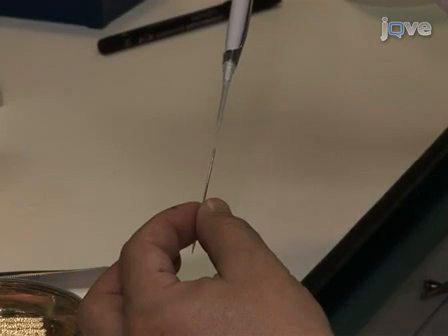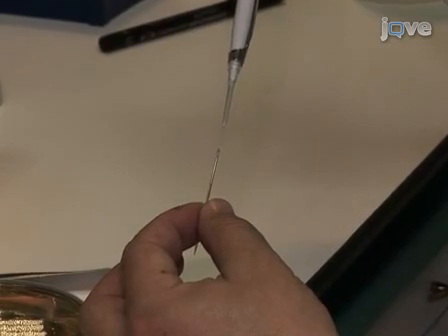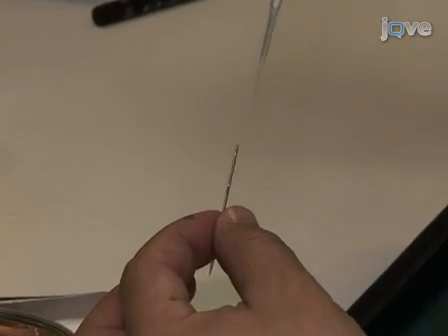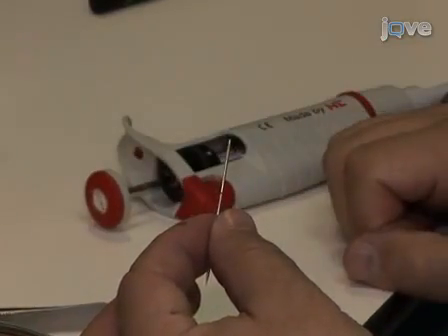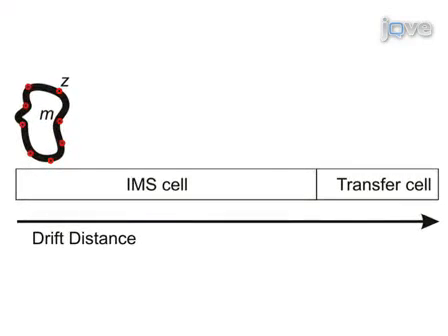Next, acquire IM-MS data for the calibrant proteins under exactly the same instrument conditions used for the target protein or protein complex. Keep all the voltages and pressure values identical to preserve the IM separation settings. After acquiring the data, extract the experimental drift time value for each charged state of the calibrant proteins.